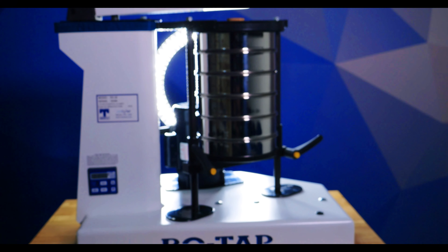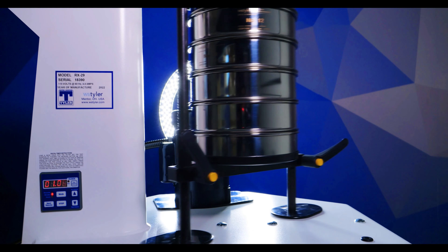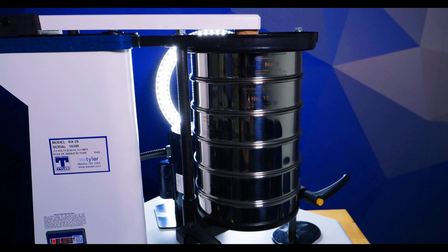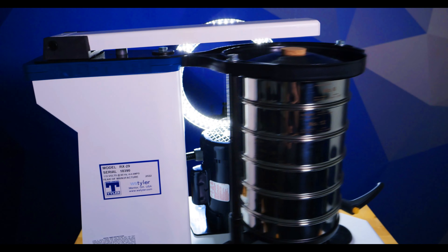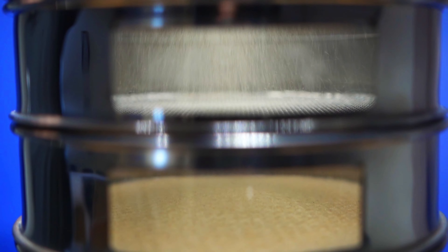Mechanical sieve shakers, like the W.S. Tyler Rotap RX-29, are machines that use a motorized system to help particles make their way through a stack of sieves. Each element of a mechanical sieve shaker works together to create the oscillating and tapping motions particles need to find each sieve's mesh openings. Mechanical sieve shakers have been used for several decades and have proven to provide some of the most accurate, reliable, and repeatable results. It's because of this that the Rotap sieve shaker is in dozens of industry standards.